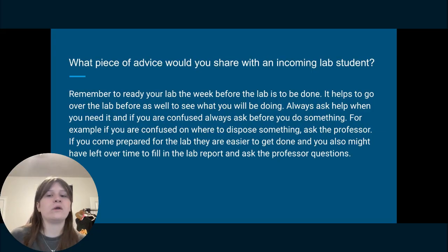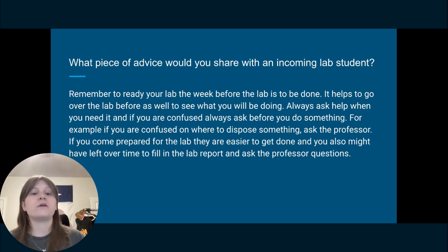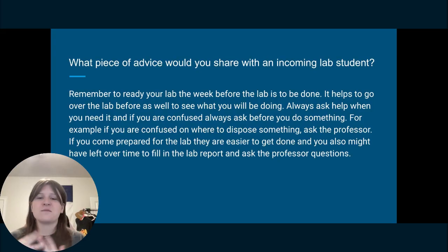Always ask help when you need it. And if you are confused, always ask before you do something. For example, if you're confused on where to dispose of something, material, chemical, ask the professor. Always ask before you do something, especially if you're like, oh, what am I doing? Where do I put this?